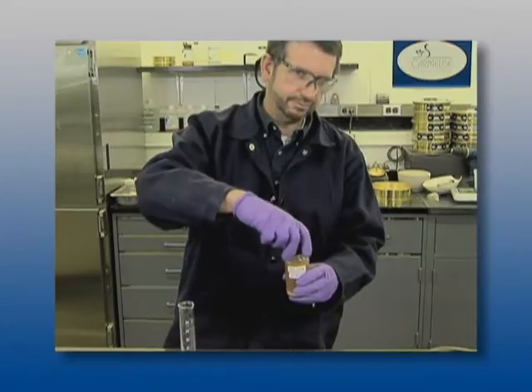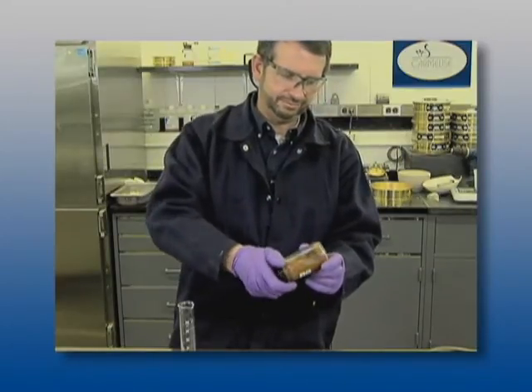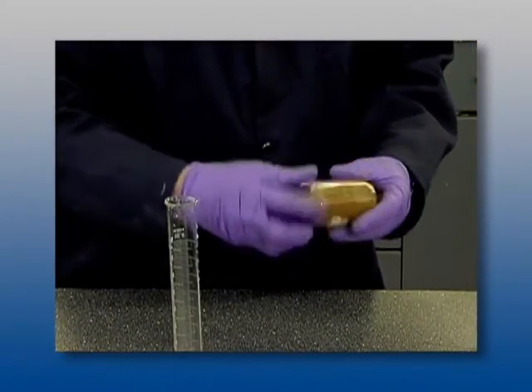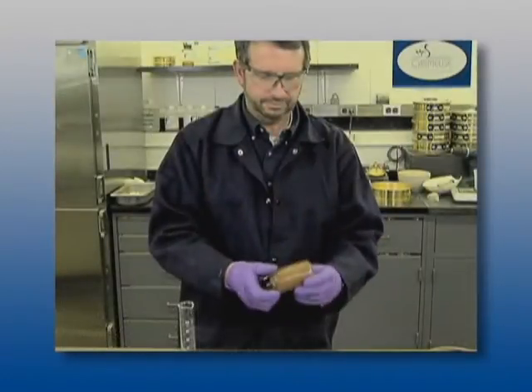It is important to begin by understanding and appreciating both what the test does and does not do. First, what the test does: it determines the amount of lime needed to maintain an elevated pH necessary to sustain the long-term stabilization of soil with lime.